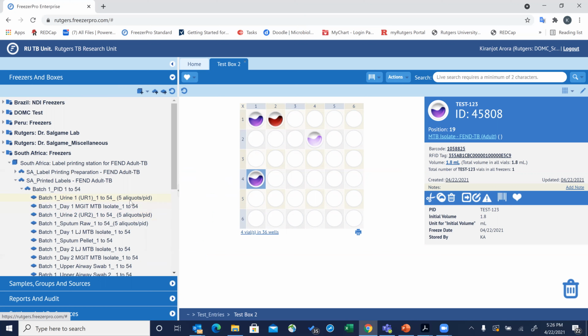But if, for example, on the first day you're only able to store 2 aliquots, then the second day you'll have 5. So that's how it will work. Maximum per day you can have 5 aliquots. So what will happen is you'll have a surplus of 3 aliquots for which you have printed the labels, but you won't actually be using those labels and those virtual samples.